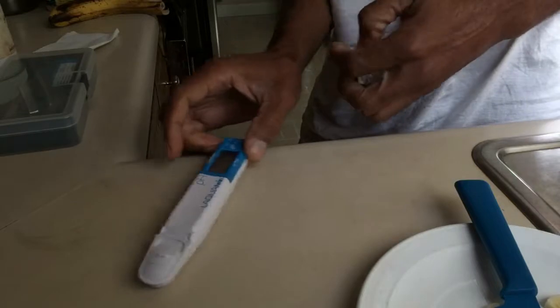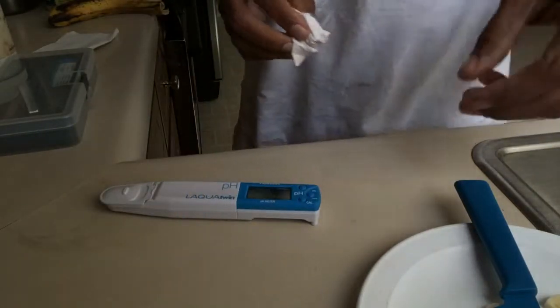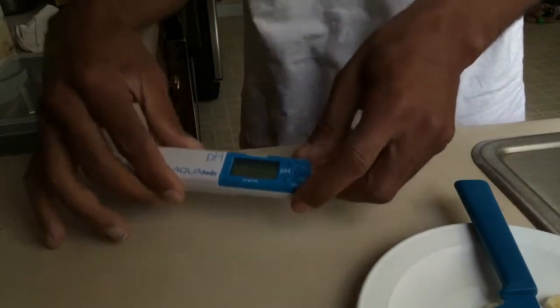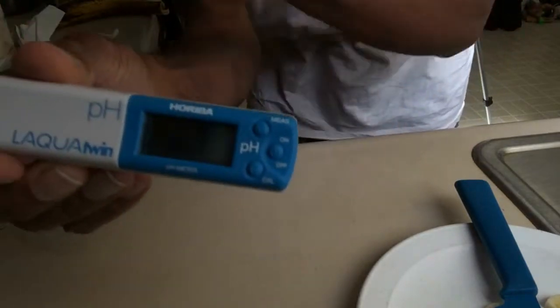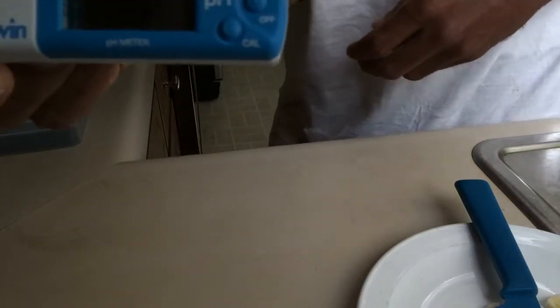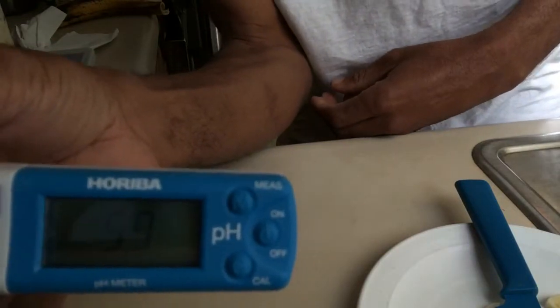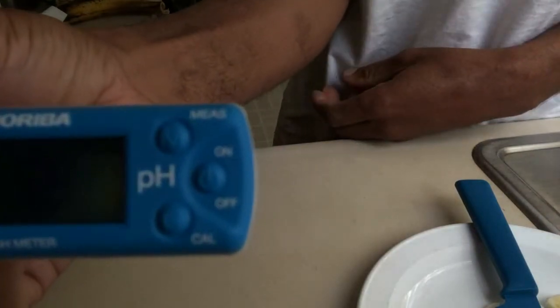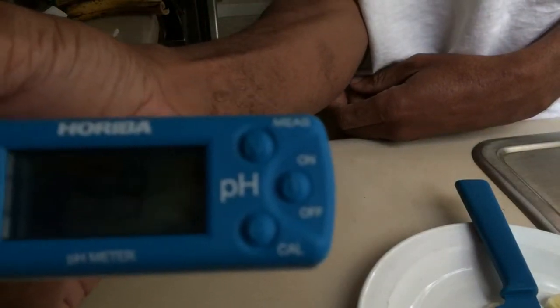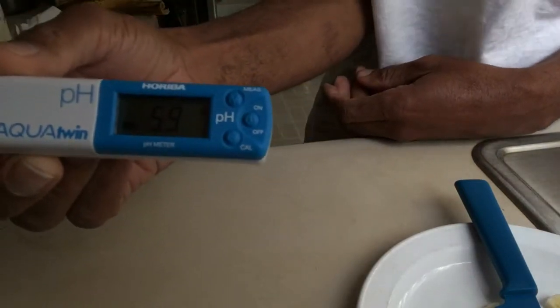Right now it's measuring the pH of the banana. It's blinking — I don't know if you can see that, but it's blinking — and when it's done blinking, that'll be the pH.